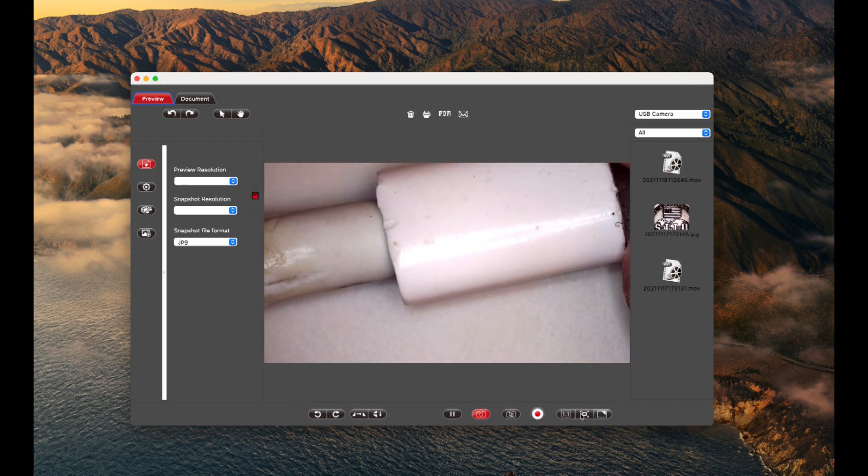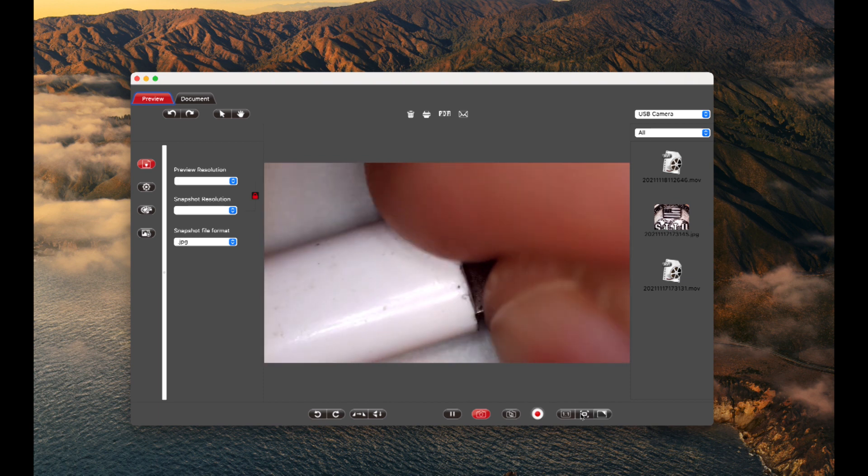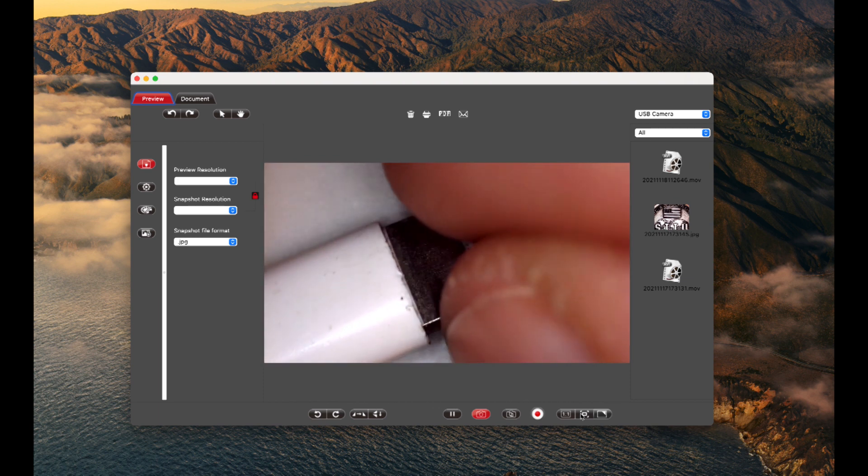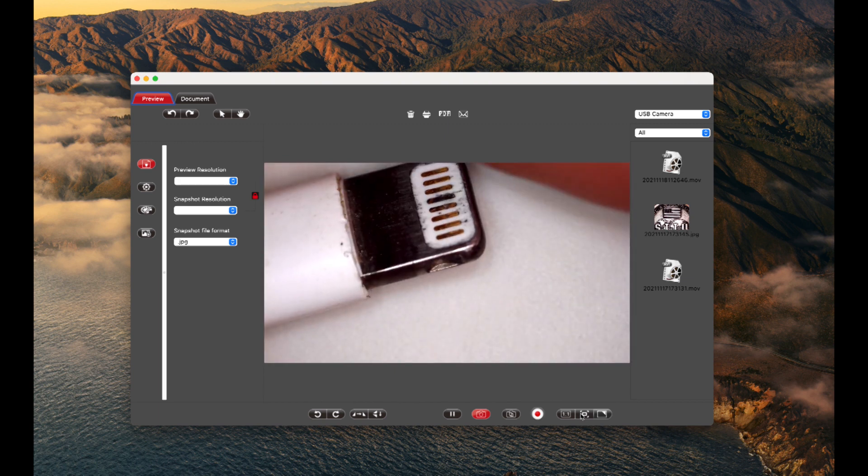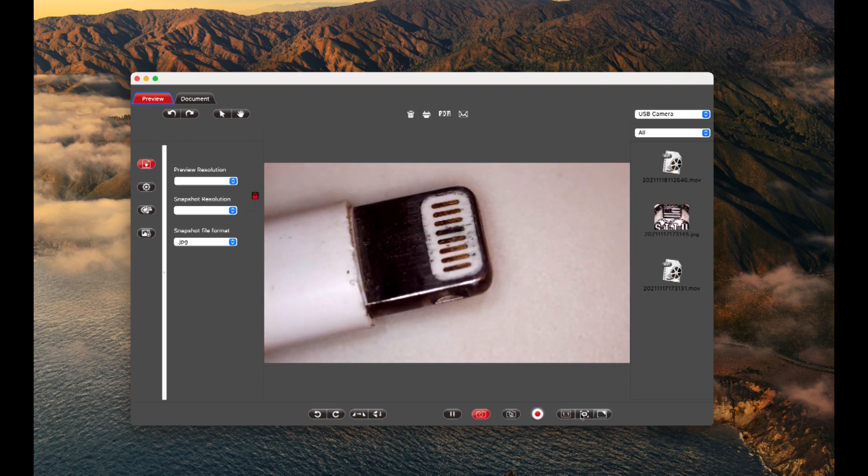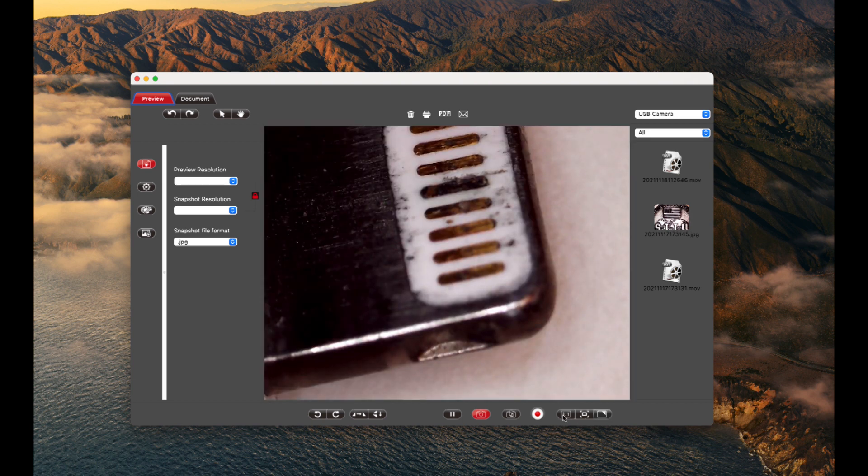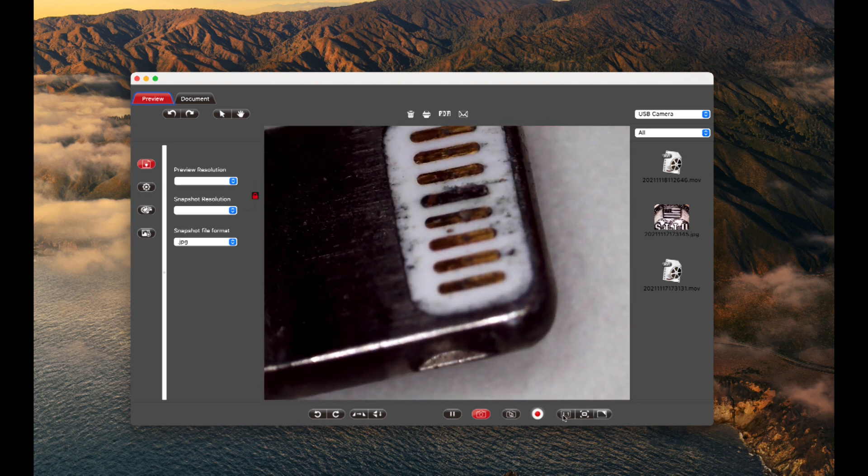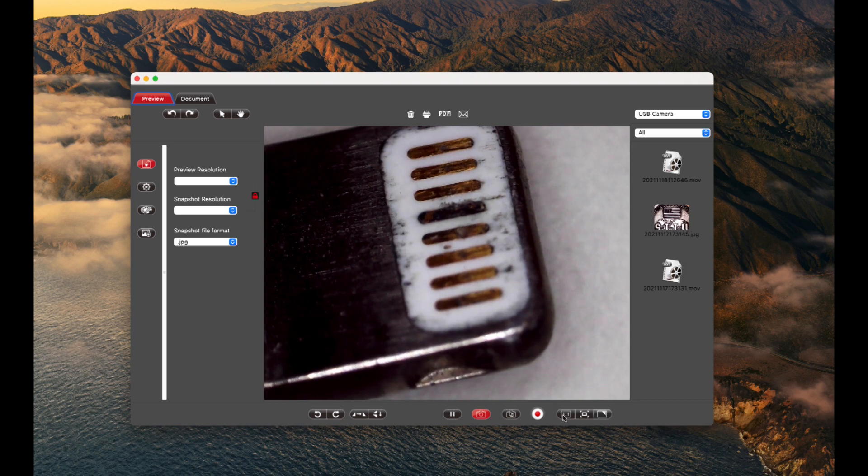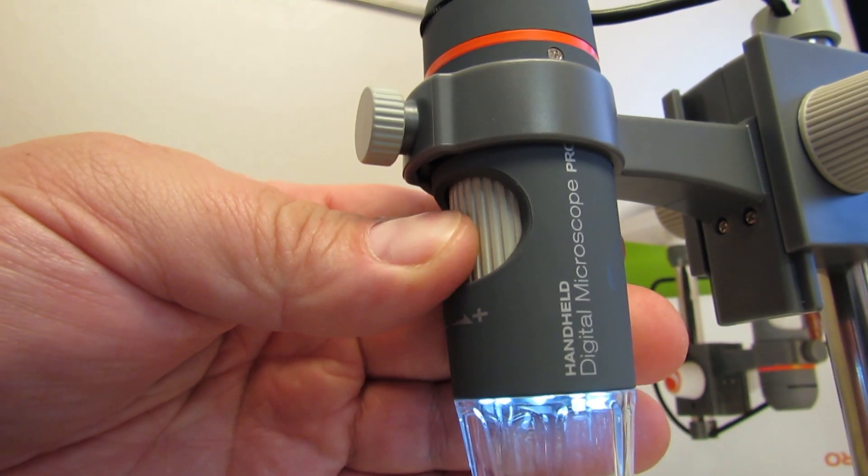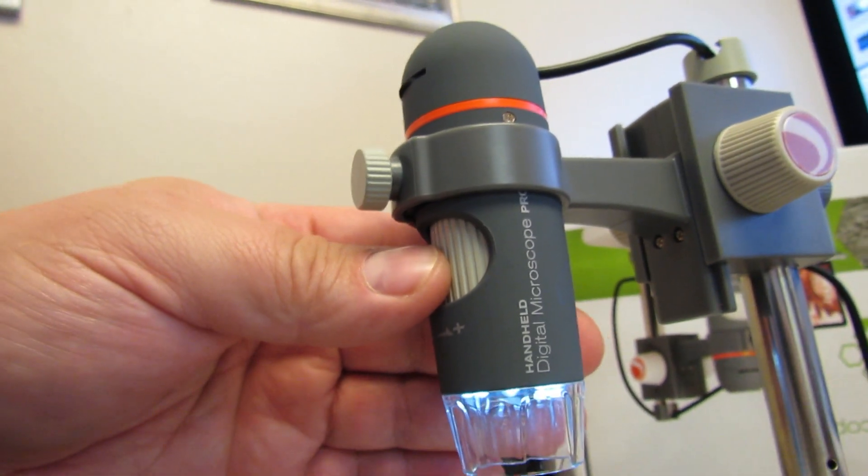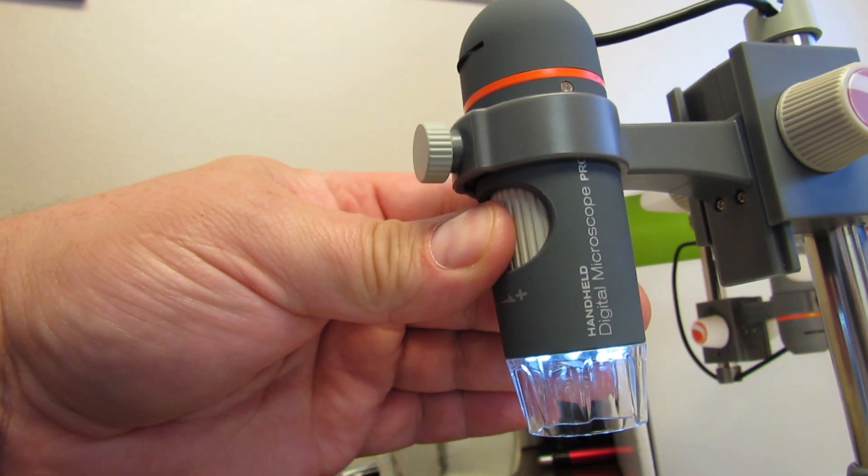We're looking at a few different things here. You can see a cord or a phone jack, just kind of looking at some stuff showing you how it works. You can click the button down there and you can zoom in quite a bit. Then I'm using a manual focus here by turning the knob on the microscope. It's actually an optical focus to make sure I get everything perfect.